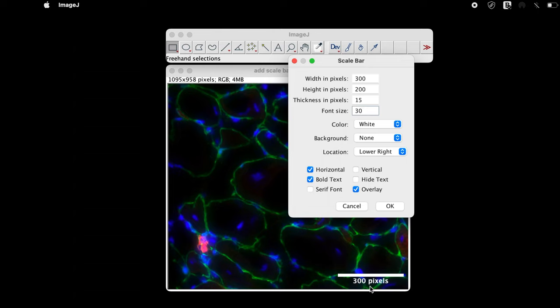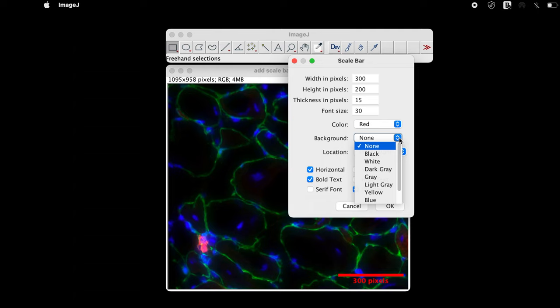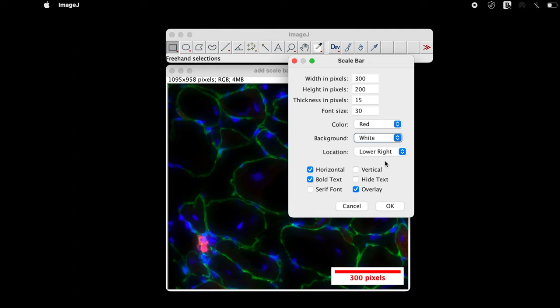The color of the bar and the text can be changed accordingly. Select the color of your choice. The background color can also be assigned to the scale bar. Select the background color of your choice.